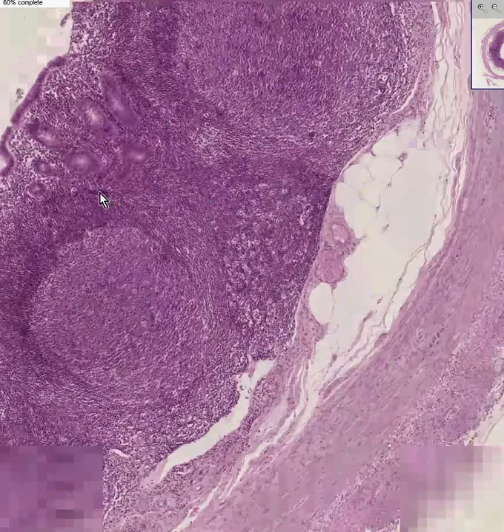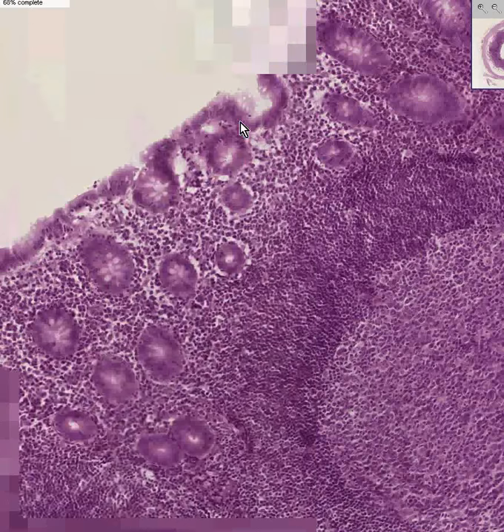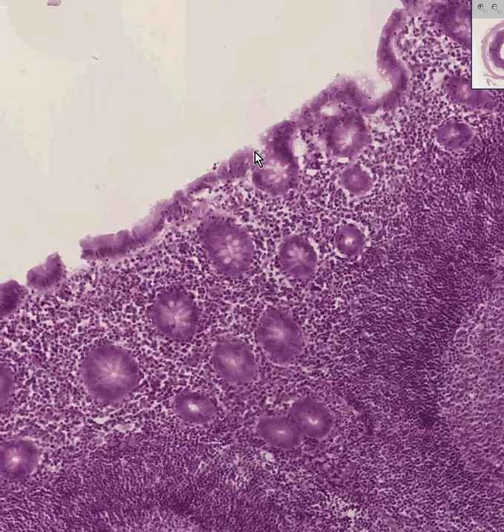And you then call, going backwards now, the surface epithelium and the small invaginating glands, or pits if you would like to call them that, the mucosa of the appendix, and the intervening cells in the mucosa, chiefly lymphocytes and some connective tissue cells, would be lamina propria.